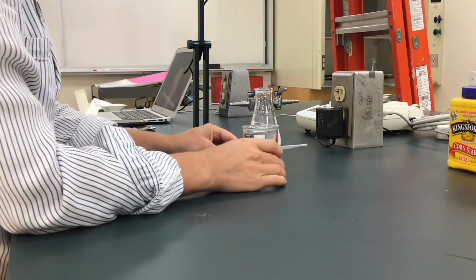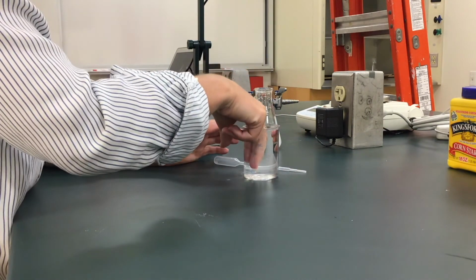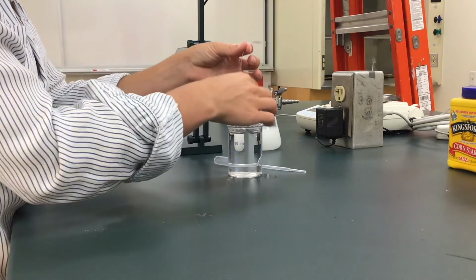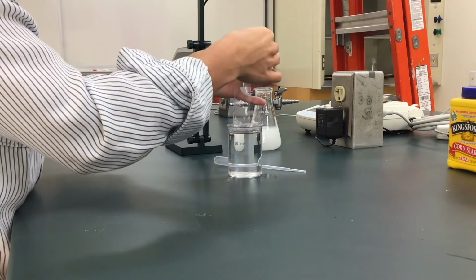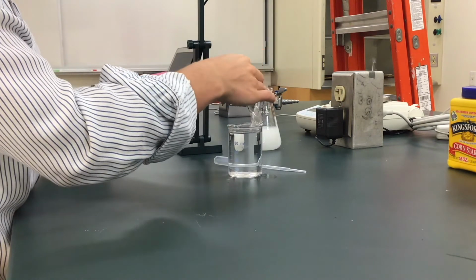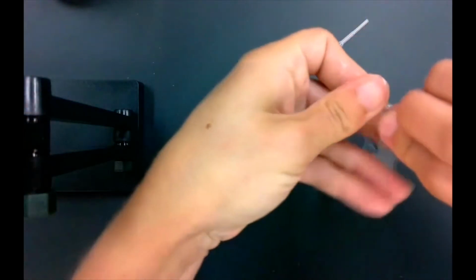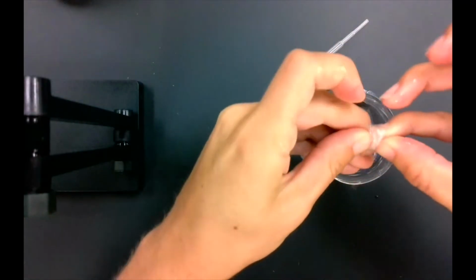The next step is to prepare our dialysis tubing. What I'm going to do is take the tubing out of the water where it is resting, and I'm actually going to tie an end to make a little bag. I'm going to do this on camera so that you can see it clearly. I use my finger, just like tying the end of a balloon.